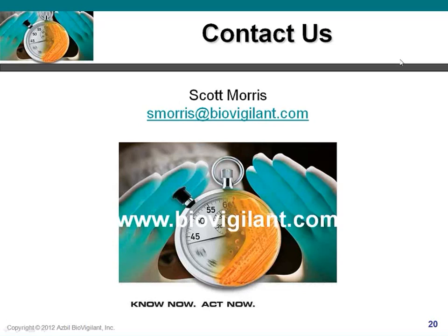Oftentimes, what we find is customers are going to put a probe for the IMDA system in the exact same location or adjacent to the location where they currently have a probe for either their growth-based air sampler or their particle counter. So in many environments, there are already isokinetic probes that are hardwired into their critical spaces, whether that's in their aseptic isolators, the biosafety cabinets, their fill lines. Those probes are typically already positioned. And so it's simply a matter of hooking the IMDA system up with some tubing to those probes that already exist and ensuring that everything is operating nominally.